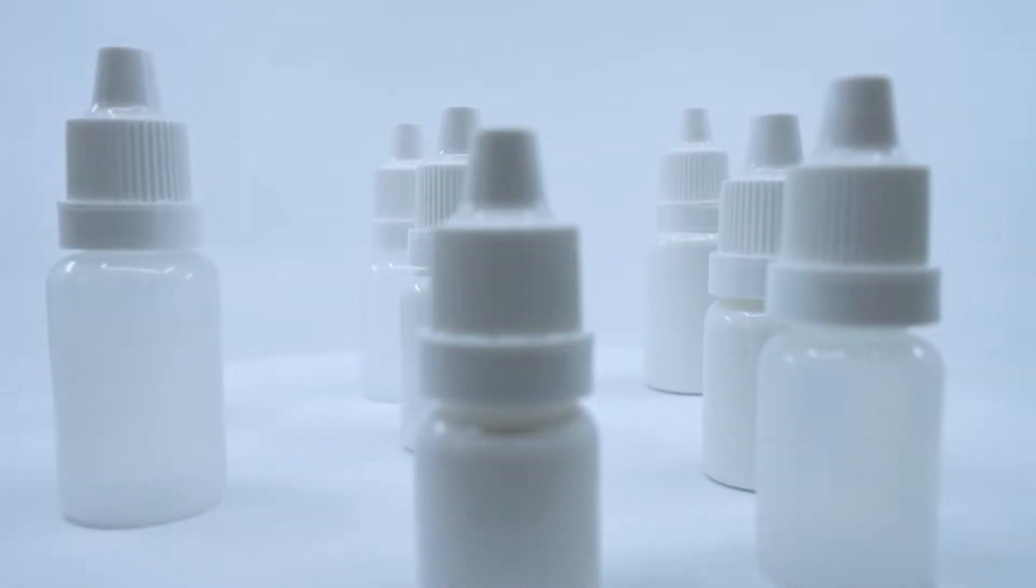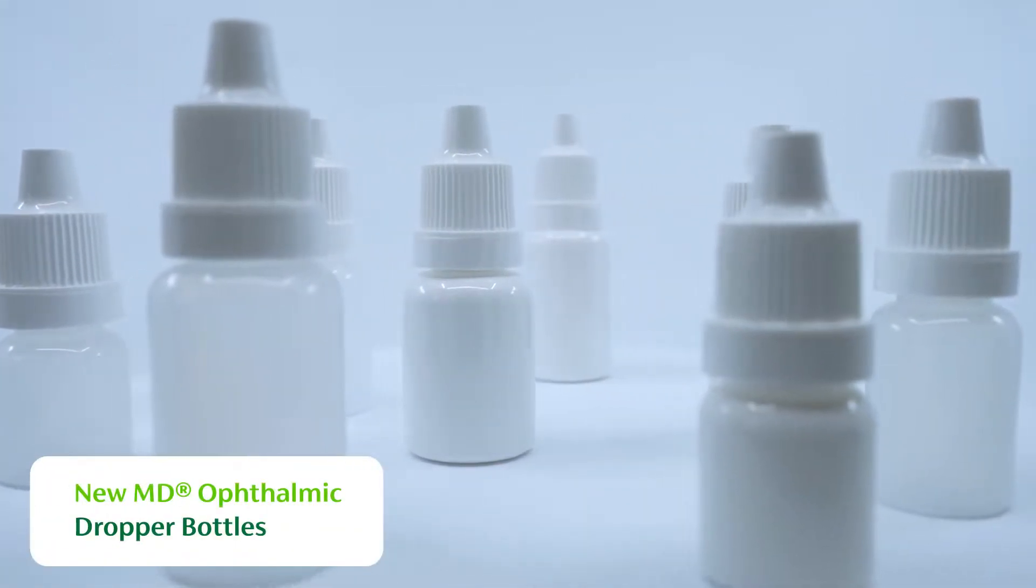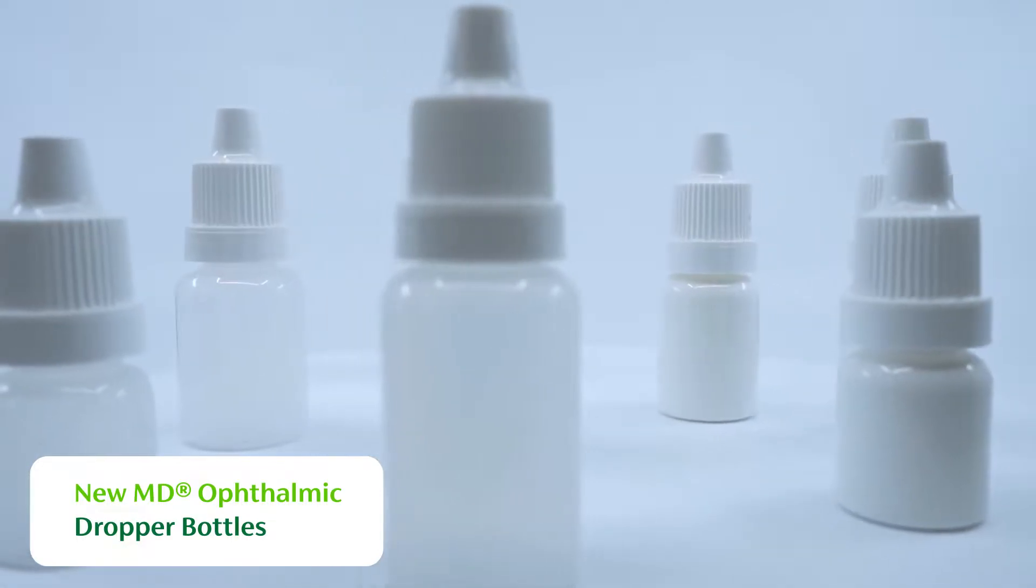Introducing the newest addition to the Medisca MD product line, the Medisca MD ophthalmic dropper bottles.